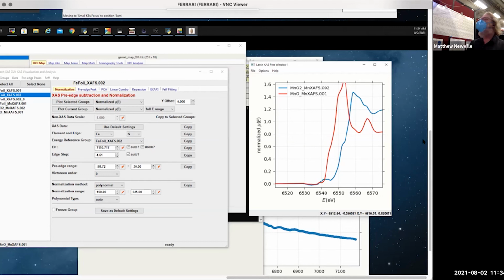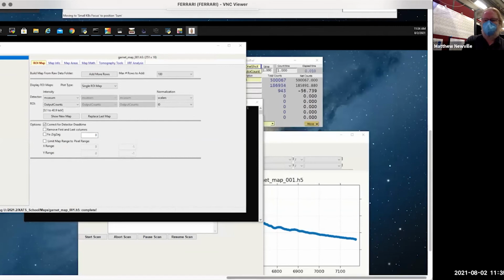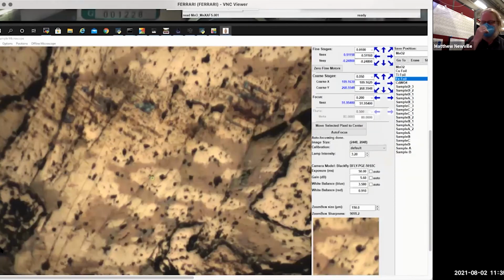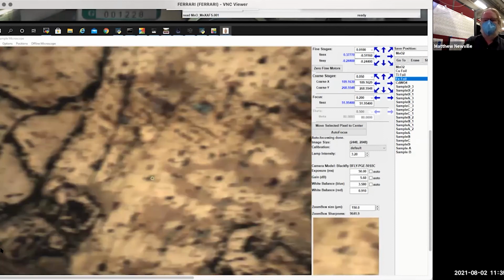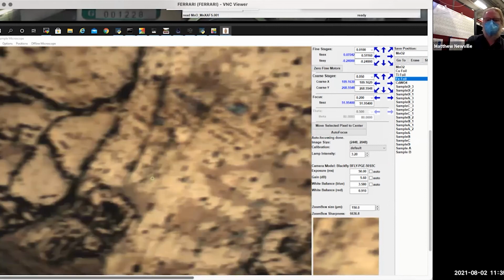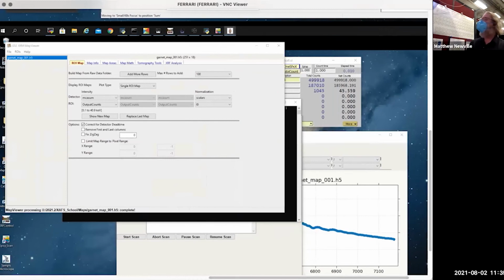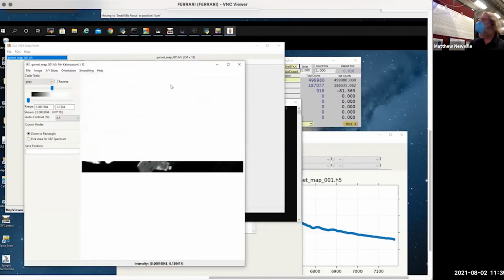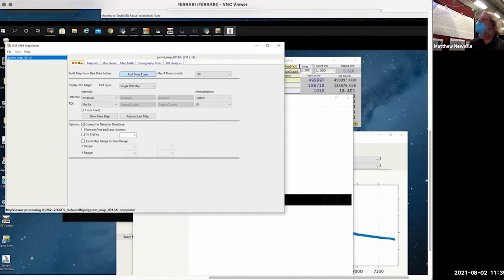I'm going to go back to this map. Let me see if I can show you that the thing is still rastering back and forth. Sample's going back and forth. And now if I go into our map viewer and read in, I can read in that data while it's being collected. So I'm just going to read that in, and I can say, let's show the counts in manganese in that map. And that's our manganese image. I'm going to add more rows. More data has been collected since we made that.